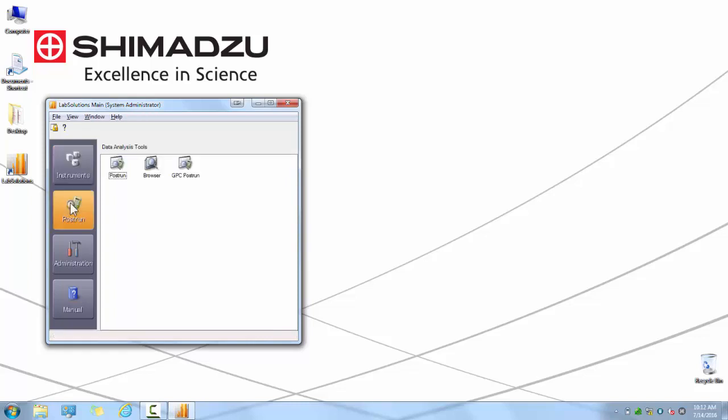The next tab is the Postrun tab. Once you have clicked on this tab, you will be able to see all the data processing software packages that are available with your license. In the case of this license, you can see Postrun, Browser, and GPC Postrun. Postrun is generally used for individual data file analysis, Browser is used for multiple data file analysis, and GPC Postrun is used for GPC data file analysis.